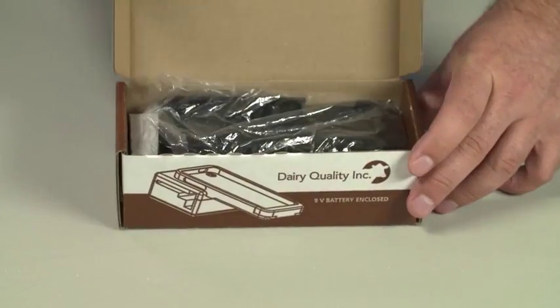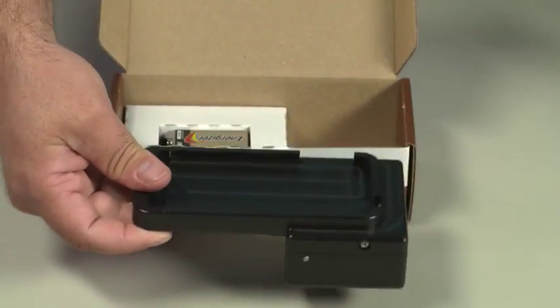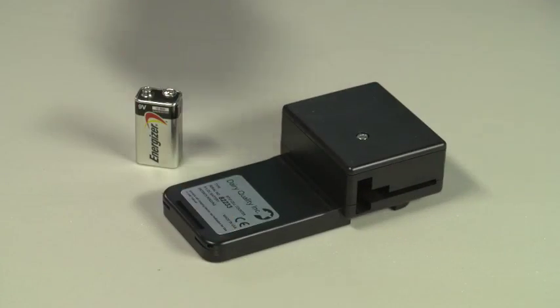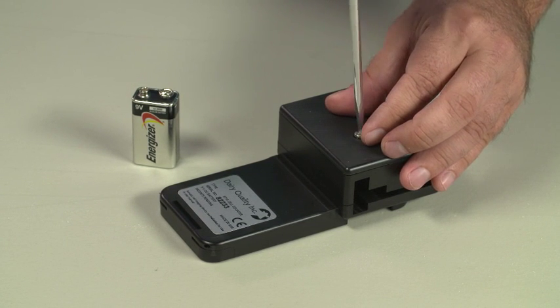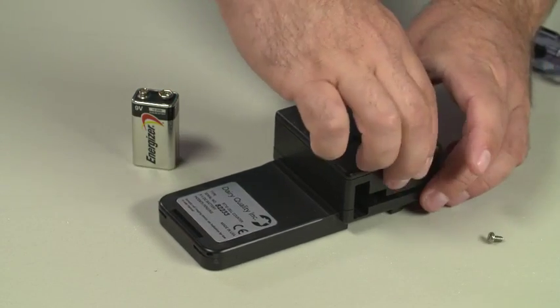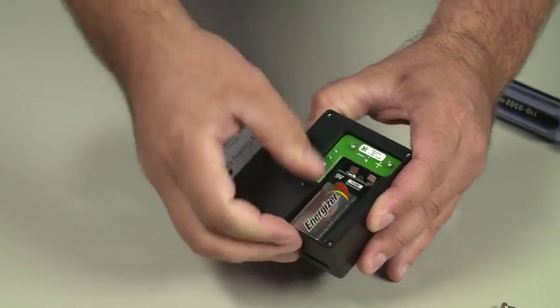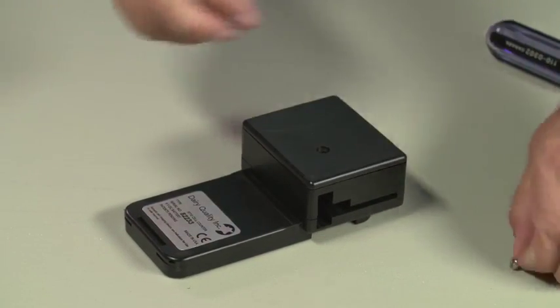To begin, remove the RT10 device from the box and remove all packaging. Remove the 9V battery from the box. Turn the RT10 upside down so that you can see the battery compartment. Using a slotted or flat head screwdriver, remove the screw from the battery compartment and then remove the cover. Insert the battery making sure that the plus and minus signs on the battery match the plus and minus signs on the device. Replace the cover and the screw.